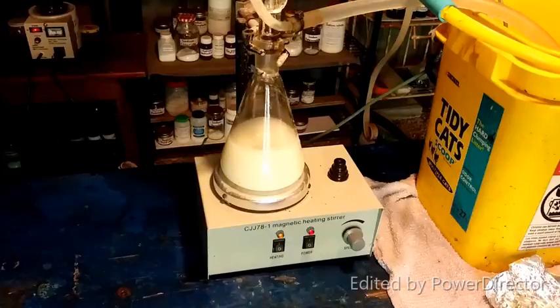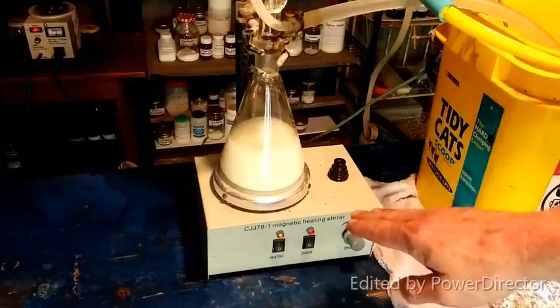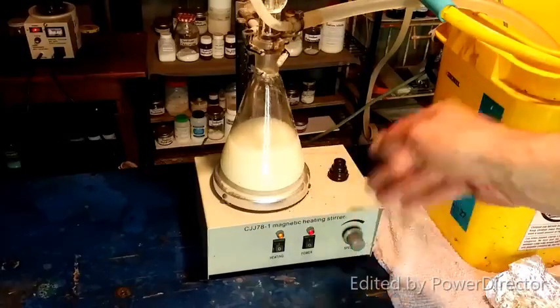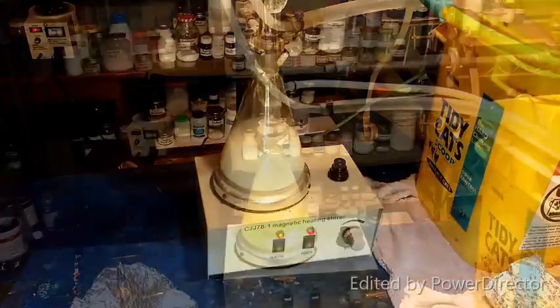And there is excess sodium iodide in there, but I'm not stressing about that, because once this is all done, I will recover all of the salt out of this, and then I will just convert all the iodide to iodine and filter it all off, dry it out by melting it under concentrated sulfuric acid, and then it will have been recycled. So, anyway, I will come back when there is something to report.